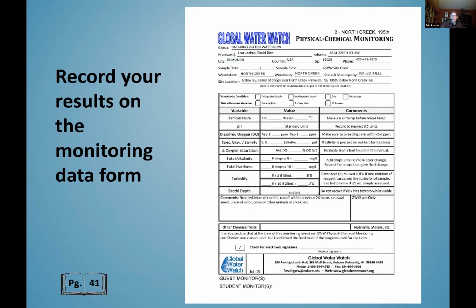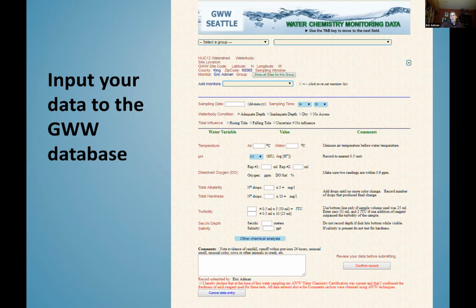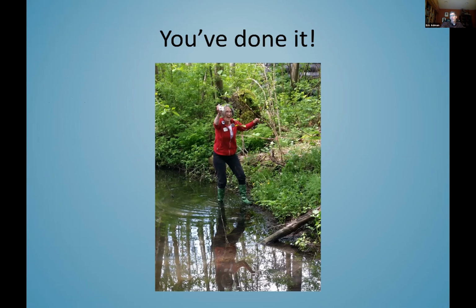So with each of these tests, as you go along, you want to record it on your data sheet, and the data sheet looks like this. And then the next step would be to enter it into the database. And then at that point, you are done with your physical and chemical data collection.